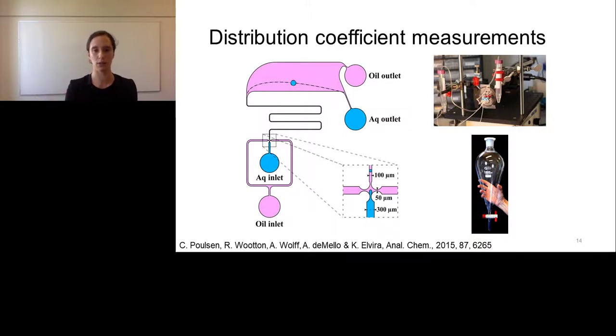One of the tests you do really early on is that you get that drug and you put it in a shaking flask, as you can see on the bottom right of that slide, and you add an oil phase and a water phase, and you shake it up, and you check how much of the drug is in the water phase and how much is in the oil phase, and that gives you a prediction of whether that drug will be happy going through the cell membrane into the cell. You can do this computationally now as well, but that is the traditional method. So what we wanted to do in this study was highlight how you can do that on a microfluidic device, and do it better and faster and more accurately.